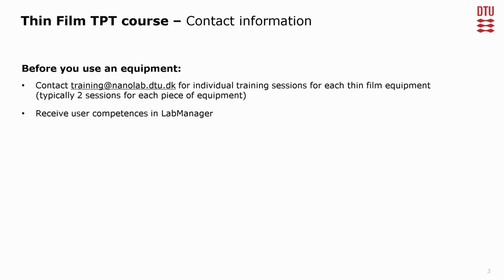Before you receive authorization to use our equipment, you must undergo proper training. We typically provide 2 training sessions for each piece of equipment. After completing the training, you will be authorized to book and use the equipment yourself. Authorization is managed through our electronic lab manager system. If you do not use the equipment for approximately 9 months, your authorization will automatically expire.